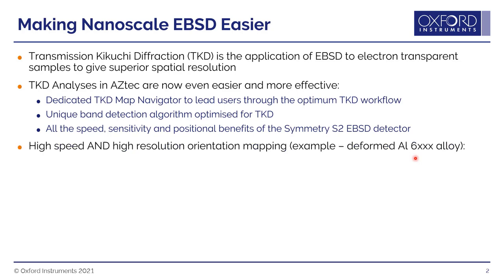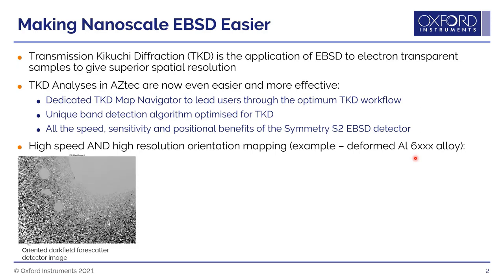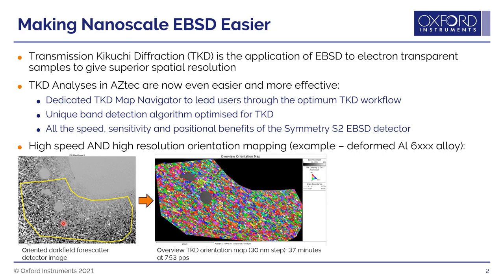What this gives us is both high speed and high spatial resolution orientation mapping. Here are some example images from a deformed aluminium 6000 series alloy. On the left-hand side we have an oriented dark field forescatter image — the field of view is about 60 microns across. Up in the top right we have the perforation on this electropolished foil, and we can see the nanostructured grain structure. We're mapping the area shown with the yellow line. This is a survey scan using a step size of 30 nanometers at a speed of about 750 indexed patterns per second.